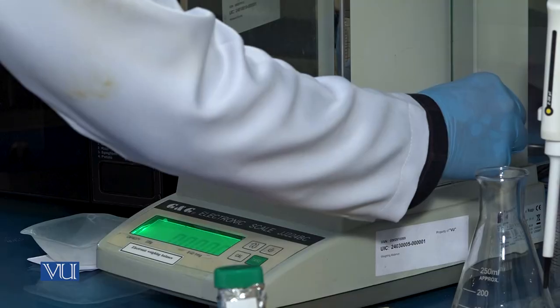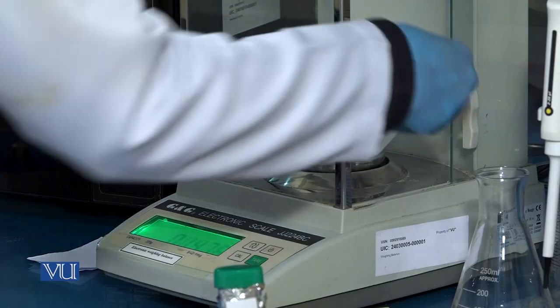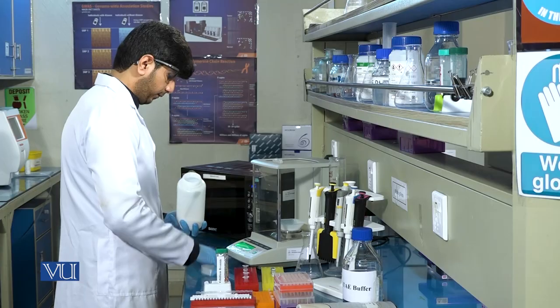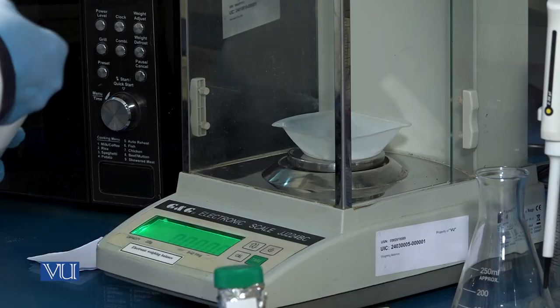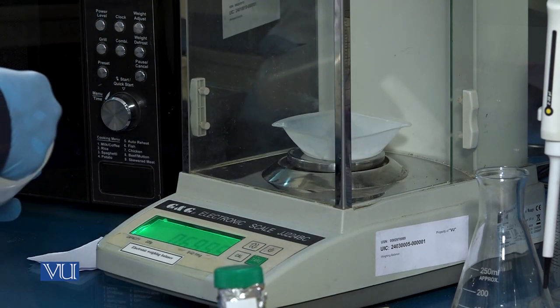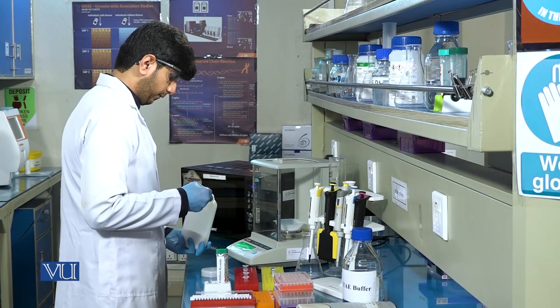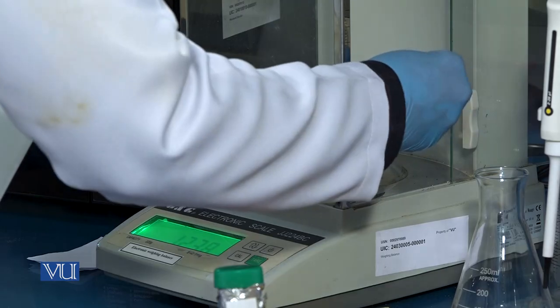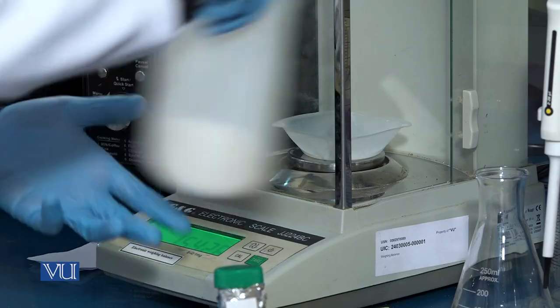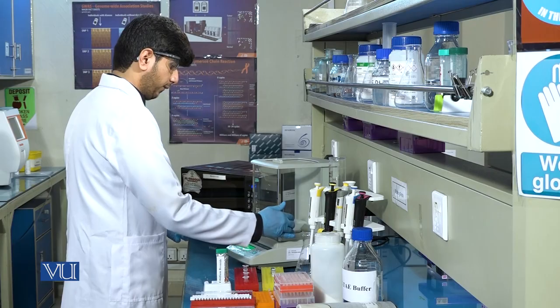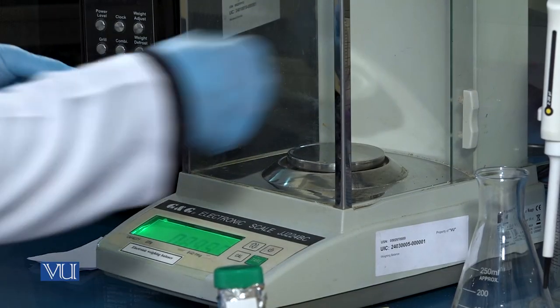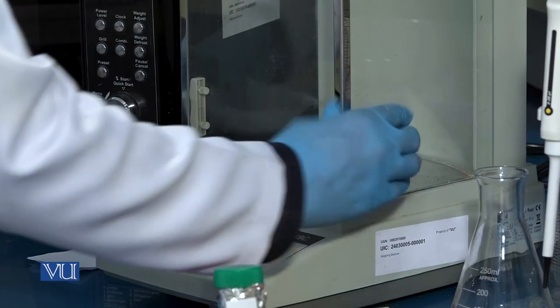First of all, we will weigh the agarose powder with the help of weighing balance. We will weigh 0.8% to 1% agarose gel. For this purpose, we will weigh 1 gram of agarose and we will add into 100 ml of TAE buffer.